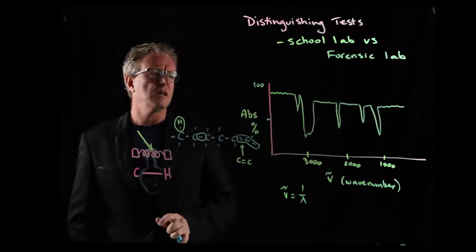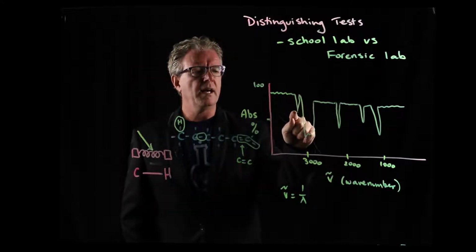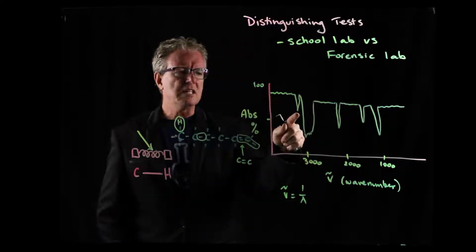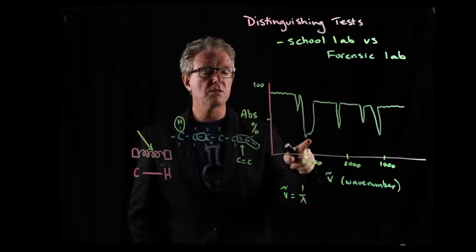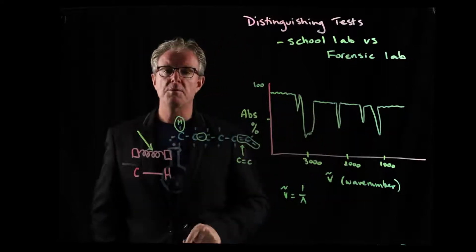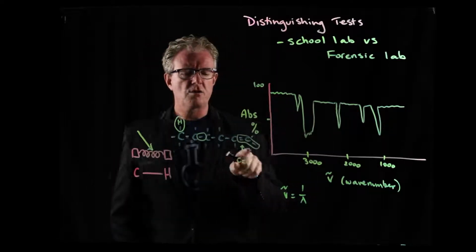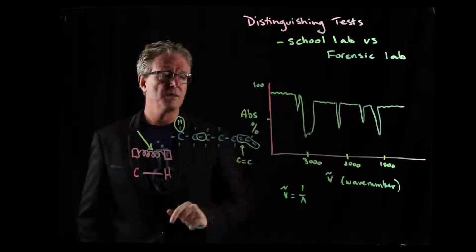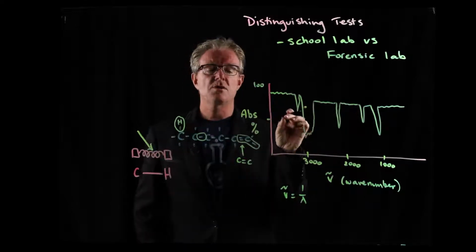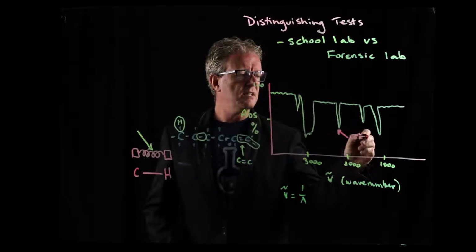Okay, we're not going to get into too much detail here, but imagine that bond absorbs energy, and when we get an absorption happening, we get a peak. We have different peaks or different stretches, and there are singlet stretches where there's one absorption, and there's multi-peak absorption. We have these areas that are characteristic for the types of bonds. So this here, very roughly drawn I might add, is the infrared spectra of hex-1-ene. And we have characteristic regions within this that we look for that tell us the type of bonds in this molecule.